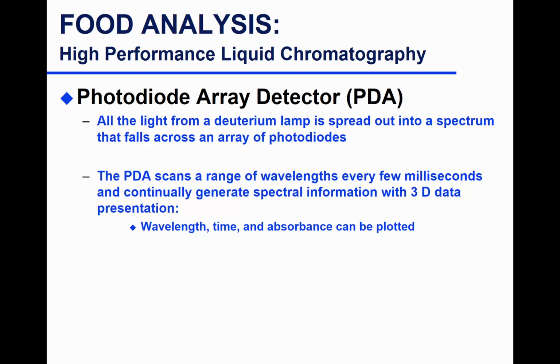Like you saw in the lab, you had, let's say, a 200 to 400 nanometer scan, and here you were monitoring absorbance. And if you remember, you have the solvent here, because acetonitrile absorbs at 220 or 210, and then you saw your caffeine lambda max absorb at 272.